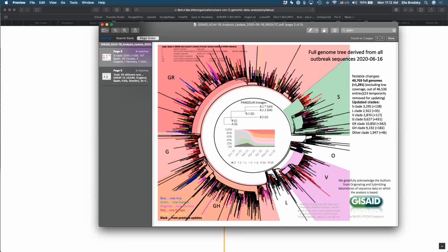That's by project, exactly. Yes, Benjamin, that's exactly what you would do, is you would look for a BioProject on the project tab.